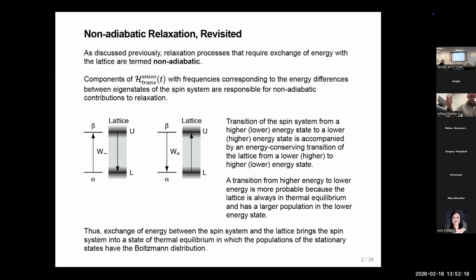All fluctuations tend to happen on a scale that's the square root of the number of particles. So let's say we have a really concentrated sample, 10 to the 18th spins. The fluctuations are going to be on the order of 10 to the 9th, which means that the fluctuations are one billionth of our signal. And we're not going to see that. We have no way of measuring something like that.